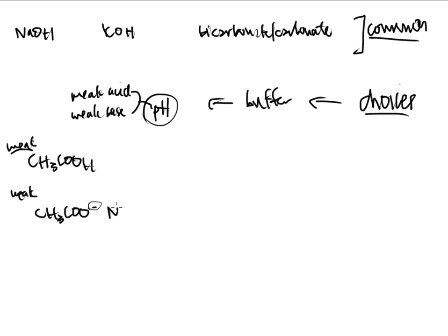And that typically can be ordered and come to us in the form of a salt. And we can use acetic acid and sodium acetate as a combination for making a buffer. And this will help control pH, which helps control charges, which is really how the IC system works.